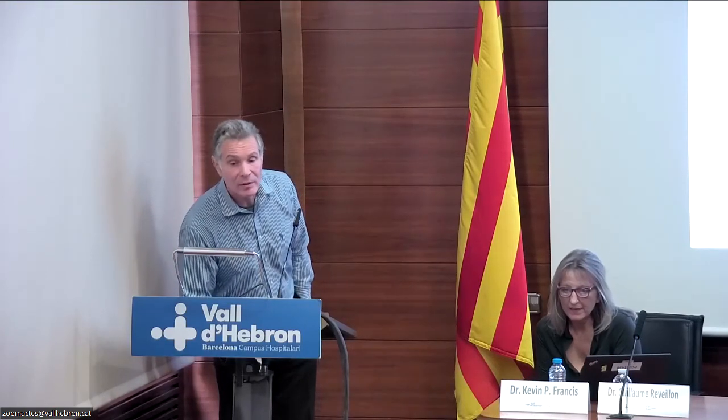Which equipment is used for the marmoset? Sorry? Which equipment would be used for the marmoset? That was actually using an EMCCD.